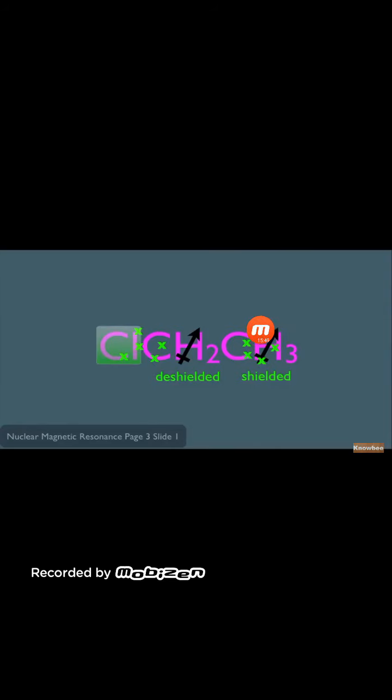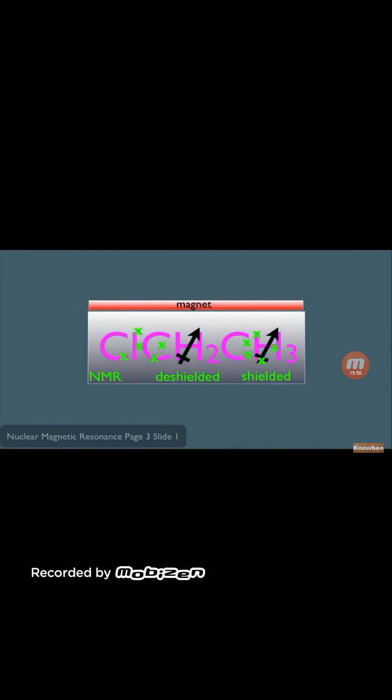The hydrogen protons are shielded. Oh, let's do this. Let's pretend we take our molecule and stick it in the NMR machine. What we saw, remember, is that if you are a hydrogen that is more shielded, it takes lower energy to bring you into resonance.